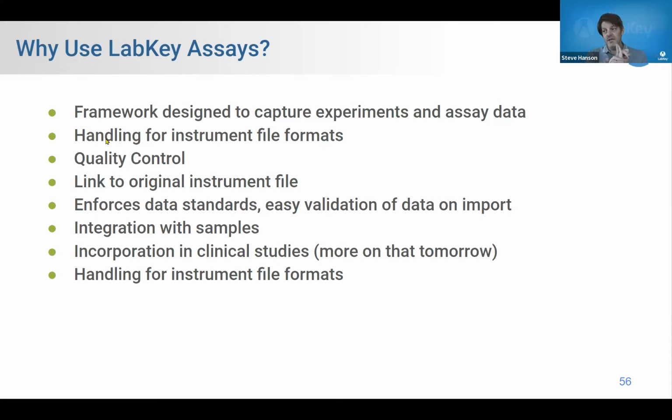Sometimes we just know the file format, we can handle it. And if not, you can do scripting to do your own parsing of the file formats. And if you don't know how to script, you can often mitigate it with just some manual stuff. In any case, that's a huge advantage of working with LabKey assays. We have a built-in quality control system for your instrument data. We also, by design, link the imported LabKey data to the original instrument file, so you get really nice data provenance.